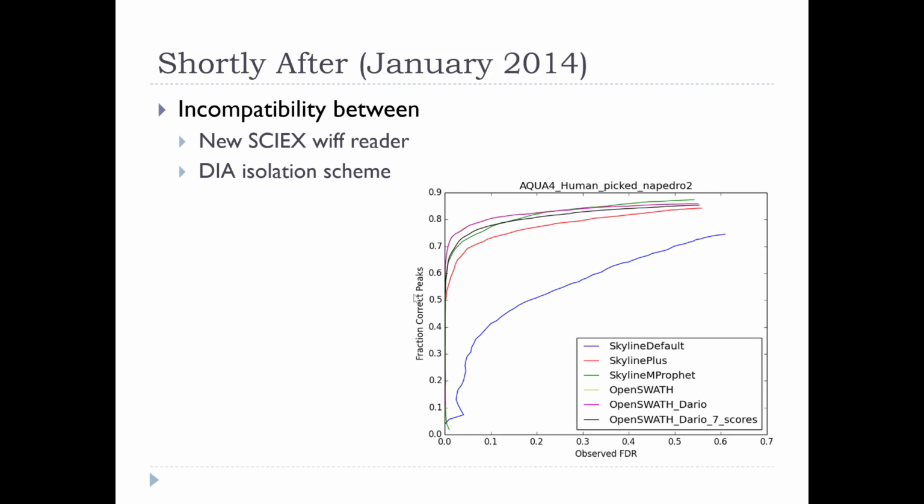It's not that we're doing a bad job scoring, we just don't see anything to pick. Eventually we figured that out. So again, visibility was key, and as soon as we did that, there was no other work to be done, and Skyline with mProphet was green, ended up higher, and did very similar to OpenSwath.